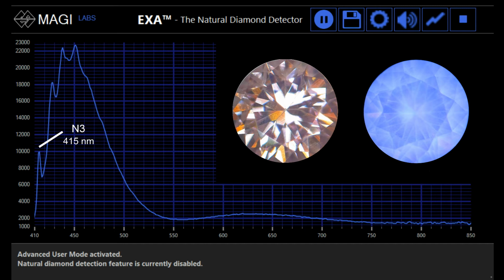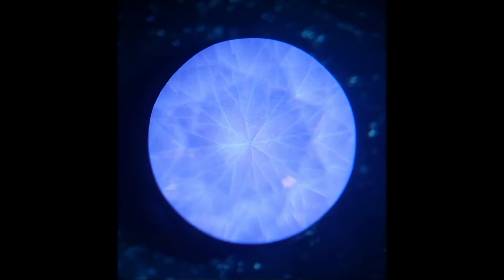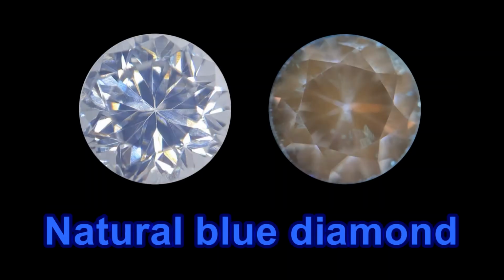It's highly suggested to carefully observe pink melee diamonds at high magnification. A diagnostic abrasion pattern on the facet junction of the pavilion is almost always present and can be revealed even more easily when the EXA beam is used in combination with a microscope, like in this case. Assembled stones can give the same reaction. It's always advisable to watch closely if the fluorescence emission is coming from the whole stone or from only a part of it.